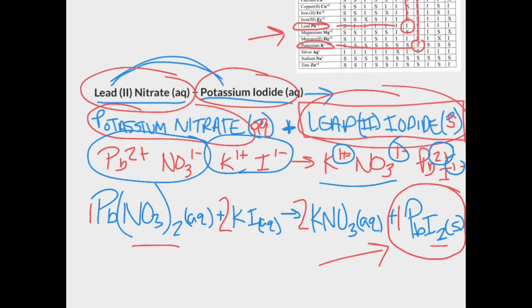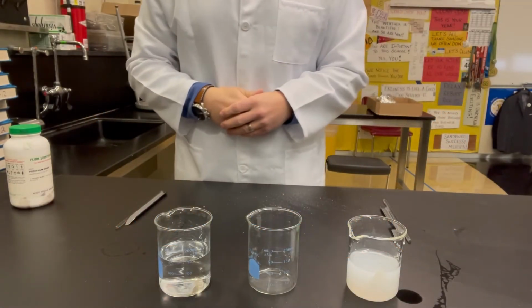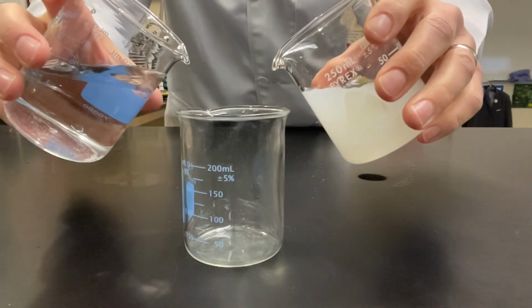So let's go back to the demo and see when we mix these 2 aqueous solutions together, will we get this new solid compound, and what will it look like? Now that we've predicted what product we should have, let's make sure it works. Let's mix them together and see what happens.